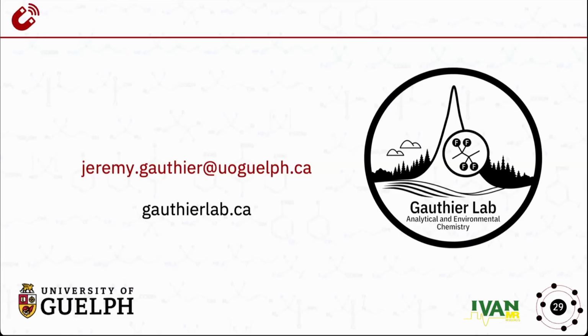As far as the instrument configuration, are you using a fluorine optimized probe, or what kind of probe is it? Yes and no. In the past, we've run it on a fluorine selective probe, but more recently, I've run it on a TXO probe here at the University of Guelph or one of the newer iProbes at the University of Toronto. So there's really no probe dependence. Some probes have more fluorine background than others, but CRAFT is actually able to tease out the fluorine background probe component from the actual spectrum or from the actual sample.